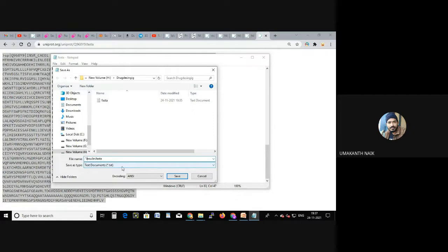Are you familiar with MEGA, Arvind? Quite familiar. At once we did it for phylogeny analysis, sir. Okay, I'll show you that one also. What's the difference here? Why are we choosing this thing?